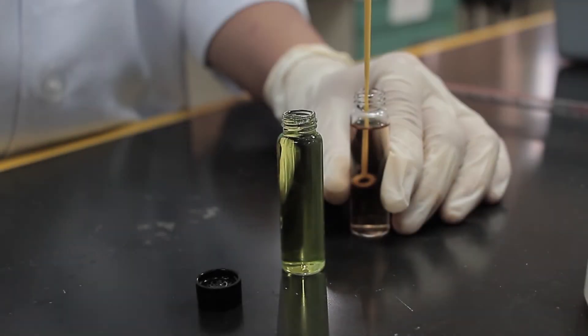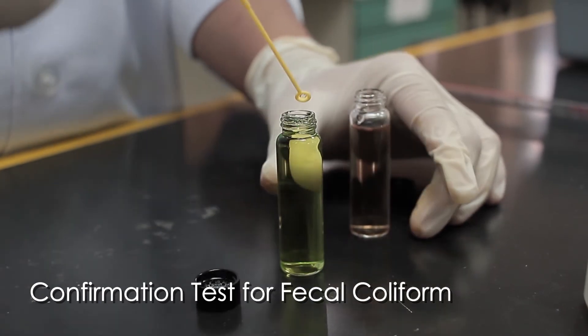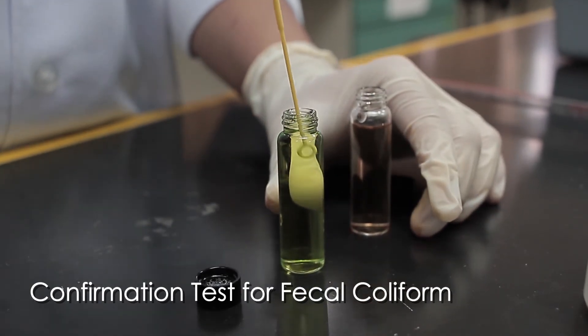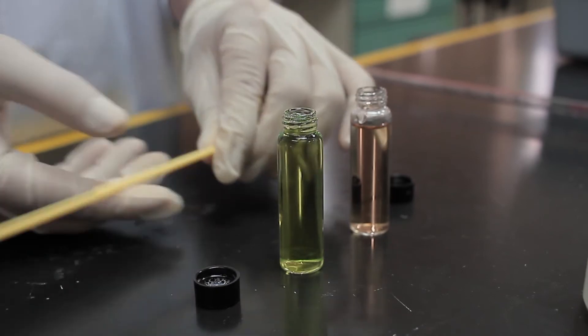From the positive LT broth tube, inoculate an EC medium broth tube using an inoculation loop. Put the loop into the positive cloudy LT broth tube and immediately into an EC medium broth tube.